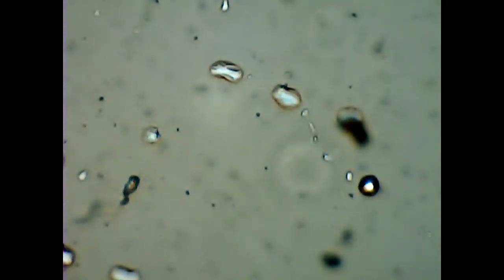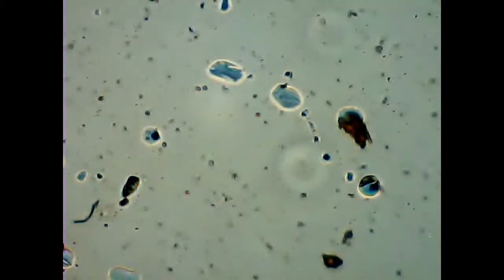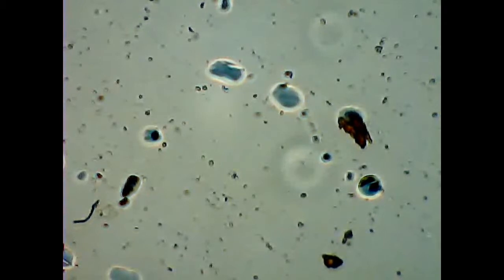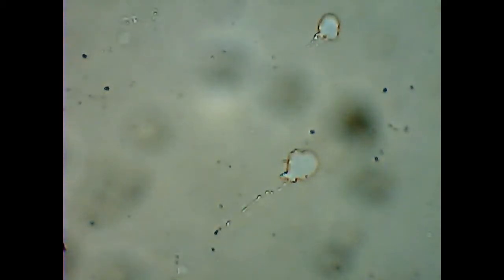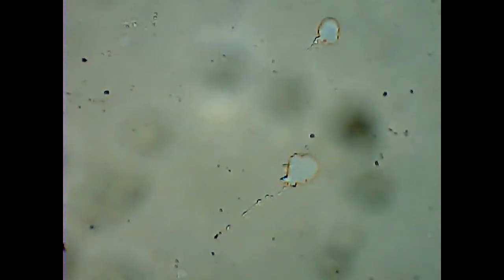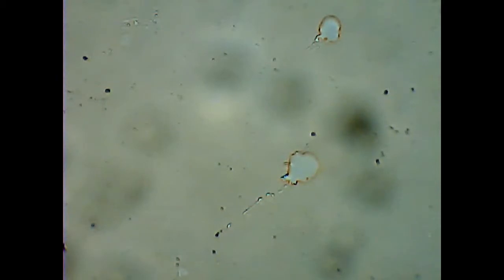The second thing I didn't understand at first is the phenomenon of course, the depth of focus. So I adjust the focus now very slowly. Now it's nothing. Now I see a layer of objects, perhaps bubbles getting sharp. Now I go deeper into the object and I get a different second layer of smaller bubbles getting sharp. And then I'm out of focus again, completely, but I adjust farther and farther, and now I get, once again, a layer of objects, bubbles, getting sharp.